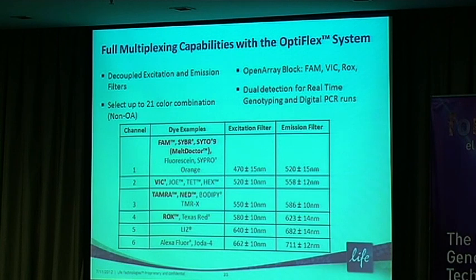So if you're truly interested in multiplexing targets, say 3 or 4 viral assays simultaneously within the same reaction, and you want to go through the work of optimizing and getting the primers to cooperate and work together, well, that's fine. The instrument is already set up to enable multiplexing. You can look at as many as 5 targets simultaneously.